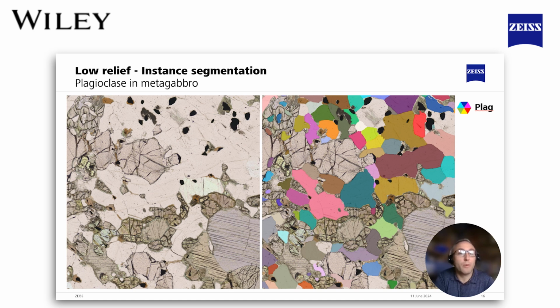This also means that one of the traditional challenges from pulling out mineralogy in light microscopy, which is low relief, colorless minerals in general, it's very difficult to do semantic segmentation for things like quartz, plagioclase, cordierite. If they're all in the same rock, we can use these multi-channel data sets and use quite subtle variations, which we're very good as humans to look at straight down a microscope and start to tell the difference between those minerals. We can train these models with enough information to pull apart these very similar looking minerals that have been very challenging for automation and segmentation.